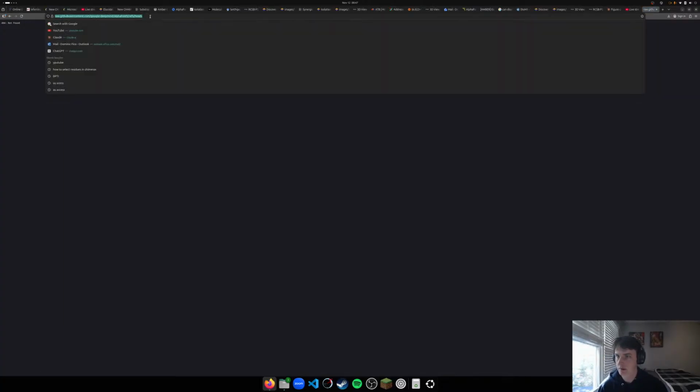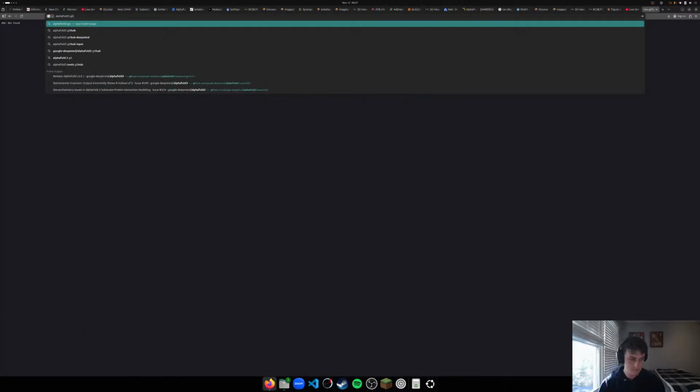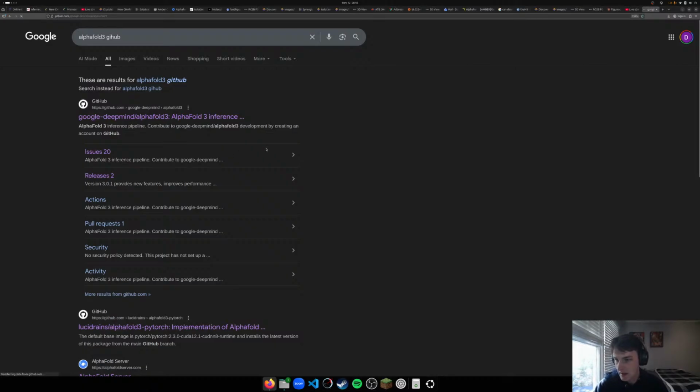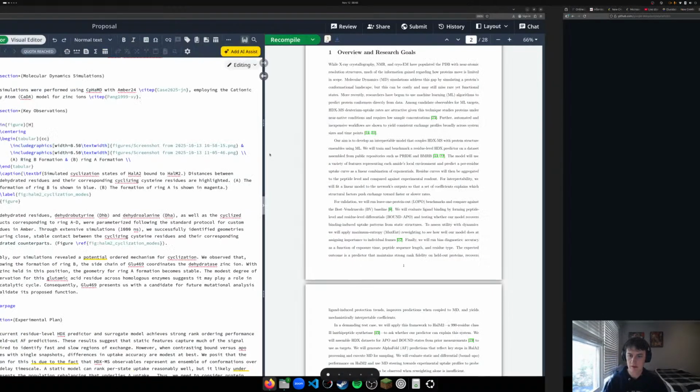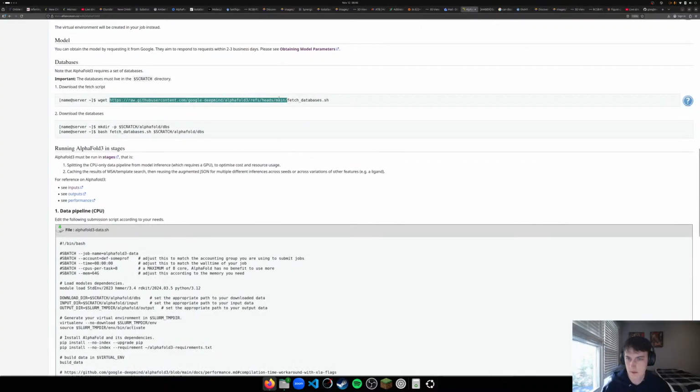I can just do that. Three GitHub. So let's look at this .sh script and see what we're dealing with.